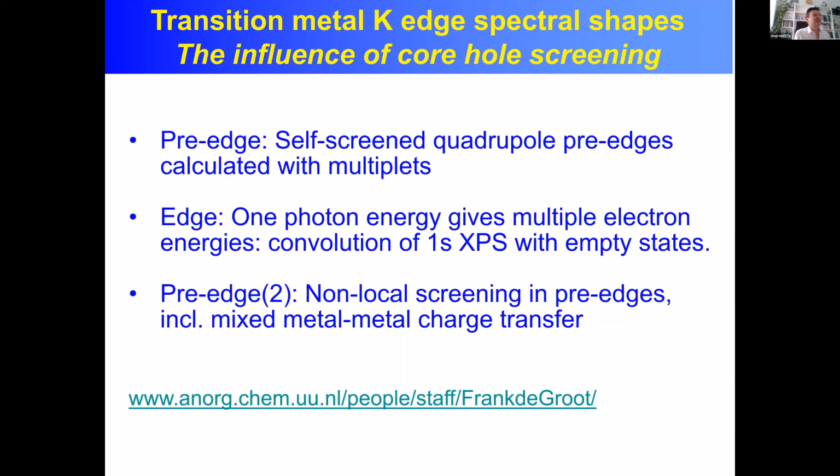That's a similar interpretation for vanadium 5+, where also in V2O5 you cannot see the pre-edge actually, you can only see the non-local peak. But I'm not completely sure about this last part, so I left it out. I'm working on this with Solomon, for example, to try to resolve this issue.